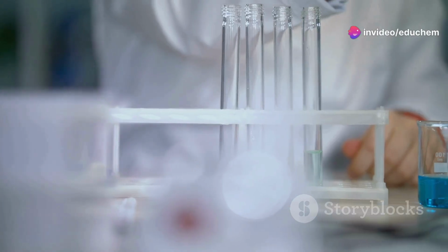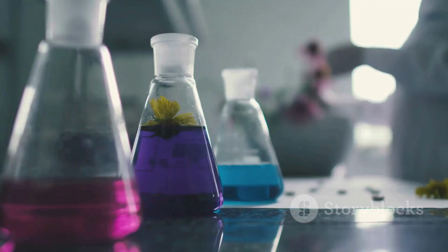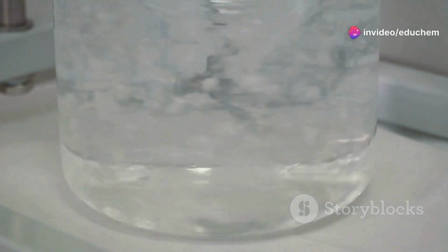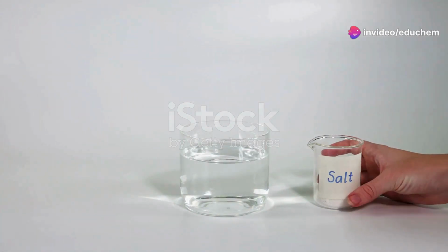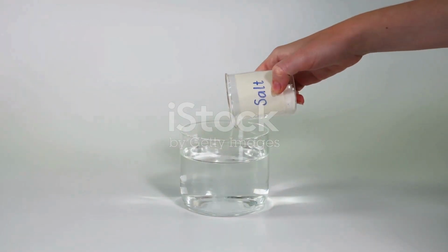And that's how you prepare salts using various methods, whether it's by ionic precipitation, titration, direct combination, or reactions with acids. There's a method for every type of salt you need. You just have to pay attention to the nature of the salt you want to prepare. Decide on which method is the most suitable and select the appropriate starting reagents.